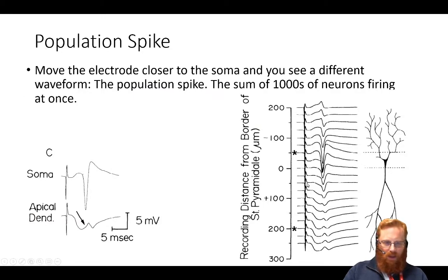Now, if you stimulate a cell hard enough, of course, these EPSPs cross threshold, and that causes an action potential. And so you can see that extracellularly as well. So if you put your electrode up near the soma, or really near the axon, if you stimulate hard enough and get a big enough EPSP, you get an action potential. And what happens during an action potential? Sodium goes into the axon through voltage-gated sodium channels, and that's exactly what we see, or most clearly here, right?